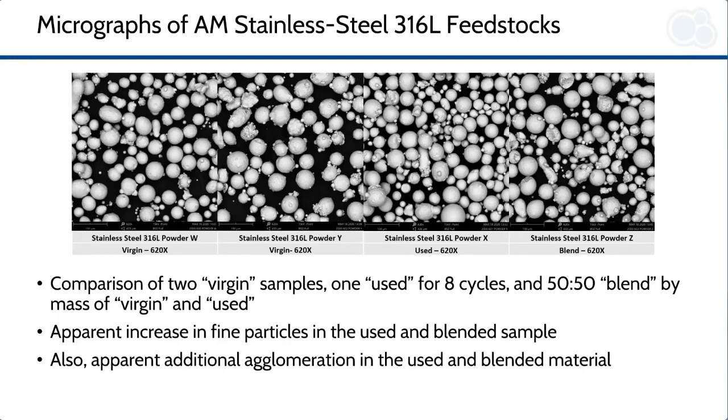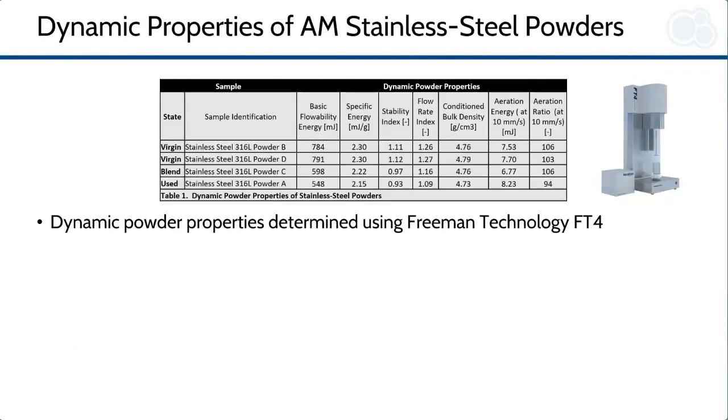Also, there appears to be more agglomerated particles in these two feedstock samples. Let's keep these points in mind as we look at the results of powder rheology and particle characterization analyses. Let's start with powder rheology.